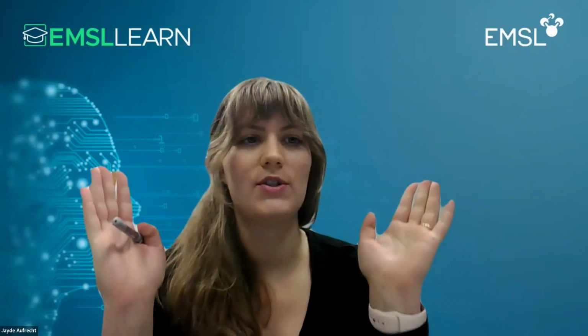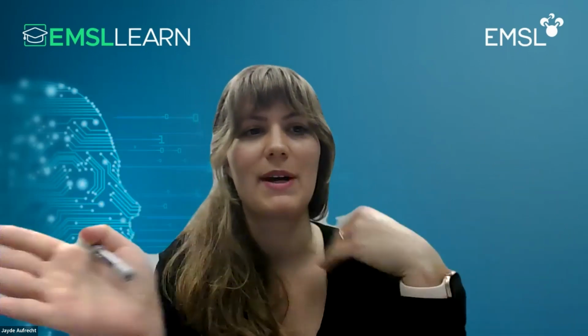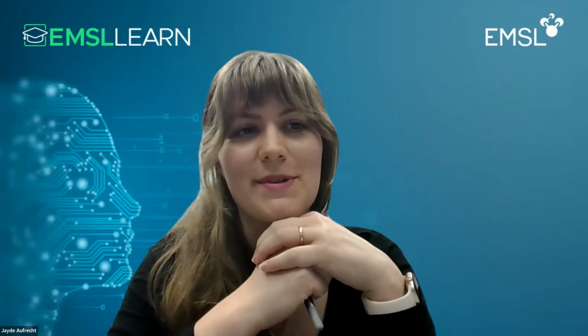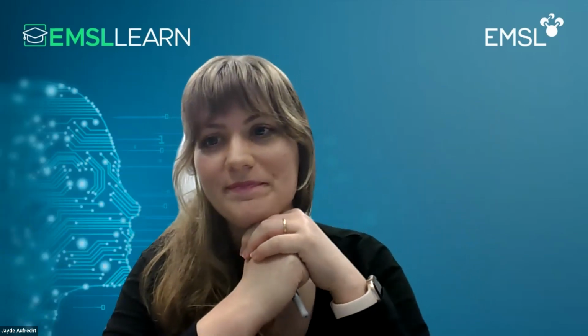So first question comes from Tina. What is the significance of the rhizochip's oval shape? For example, why not circular or square? Tina, we can definitely do circular or square. The oval shape for us, we were thinking it would maybe help guide the roots down the rhizochip and be less invasive than having to make the roots take a 90-degree angle turn. But definitely customizable still. We can do different shapes as well.